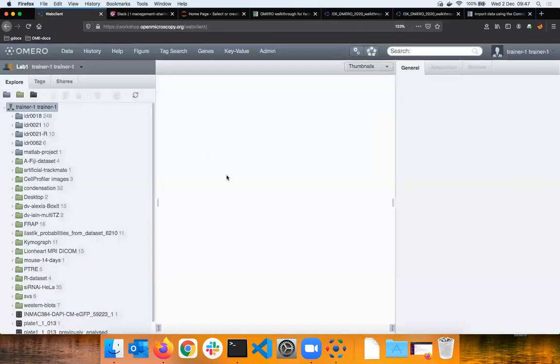I am now back in OMERO Web. Are you on the same footing with me, ladies and gentlemen? Yeah, back in OMERO Web, I'm logged in as trainer one, you are logged in as user, whatever, and you have a nice scientific name here on the top right. Some of you will be, let's say, Charles Darwin or whatever. I was Irene Joliot-Curie a second ago, and you are browsing the data of yourself in this case. You have here the same name as here, okay?